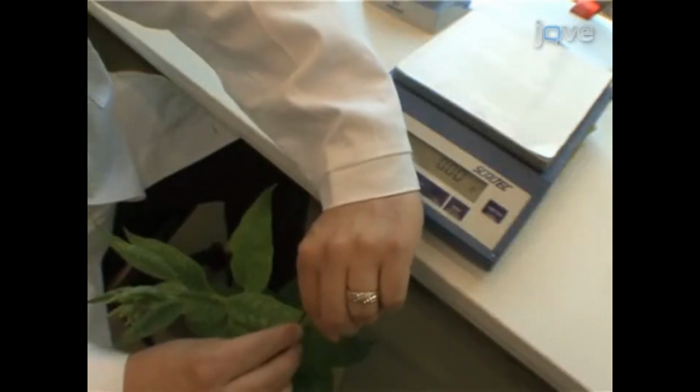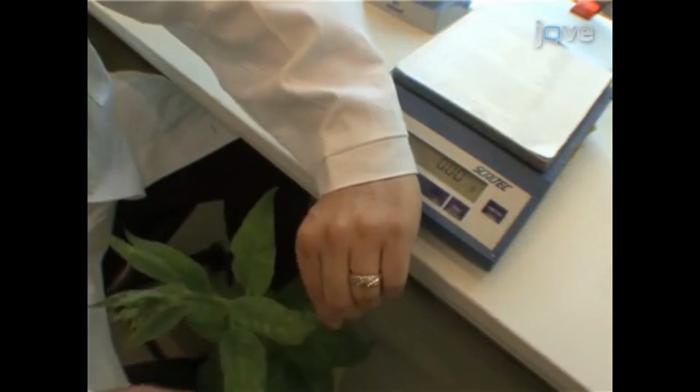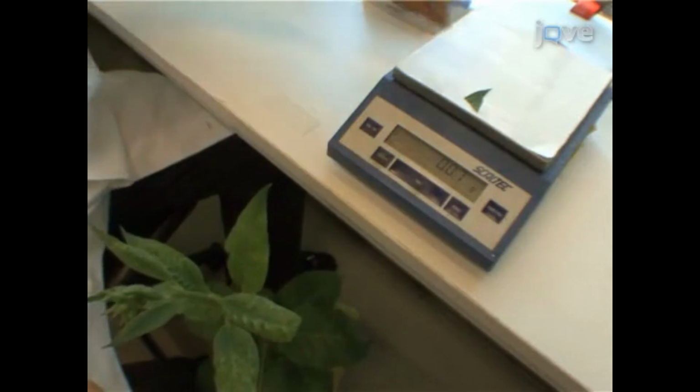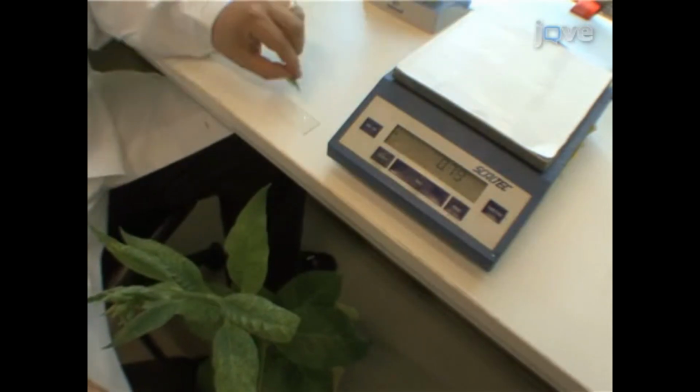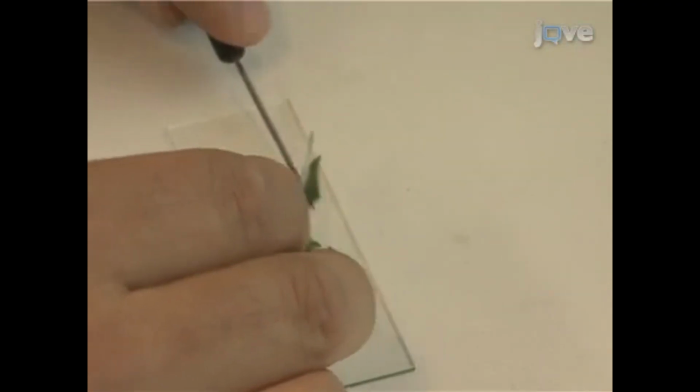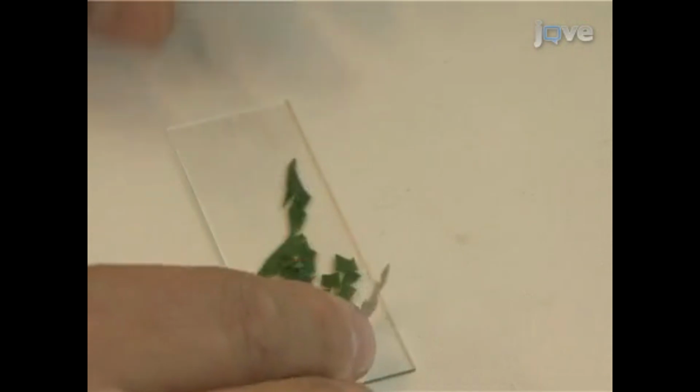Negative staining of the remaining plant material is carried out while sample preparation is being performed automatically by the microwave tissue processor. First, harvest about 100 milligrams of TMV-infected leaf material and prepare crude sap by homogenizing the material for 2 minutes with a razor blade on a microscope slide in Sorensen phosphate buffer.